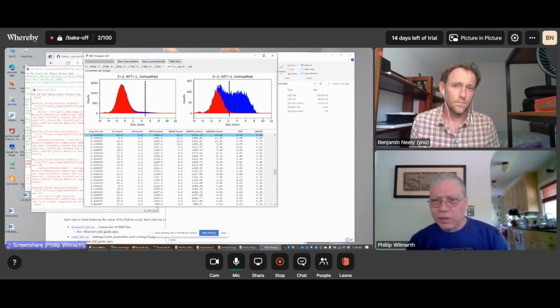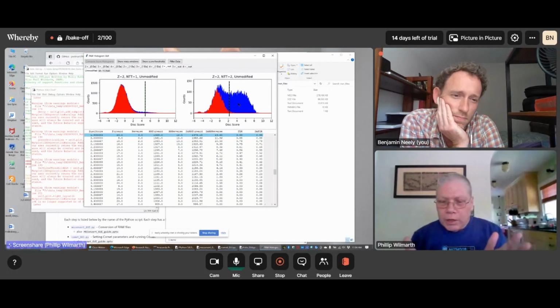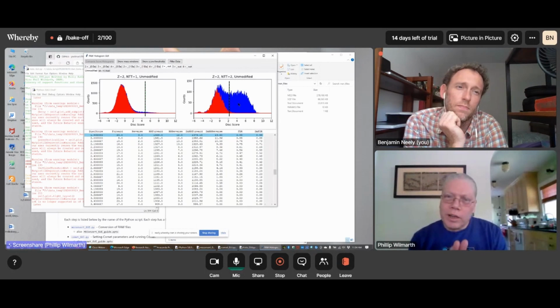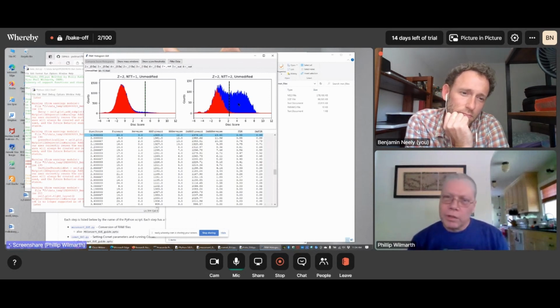But collectively over the whole region, they do add up, and they can often be a few percent of the identifications. So this is a way to increase the sensitivity. In the old days, I think that if things were quite noisy, the instrument couldn't assign a monoisotopic mass, or make that call, but it still knew there was an ion there. And because the isolation window is quite a bit wider than the high resolution survey scans, it'll still acquire an MS2 scan. And then because the ion trap can accumulate ions, you can still get a good enough signal to noise on the MS2 spectrum to identify something.